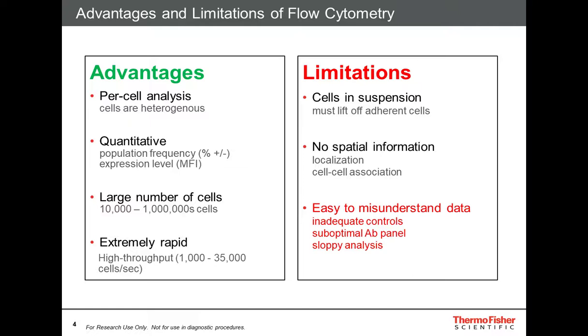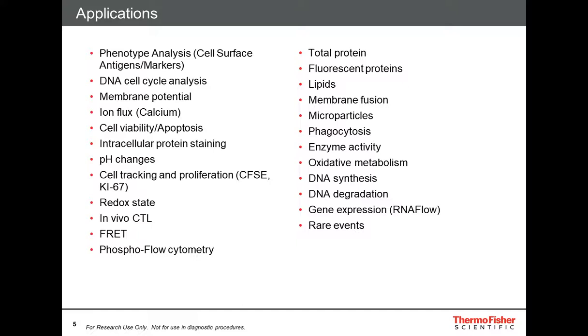It's very important to have the adequate controls to understand a little about physics and a little about antibodies, and to do a very careful analysis. People that are just starting out in flow can do the analysis the same way somebody that has 30 years of experience. It's just really important, and sometimes, in fact most of the time, you'll have more controls than you will have samples. So it's just really important to follow some important steps to get really good flow data, and we'll talk about most of those here.